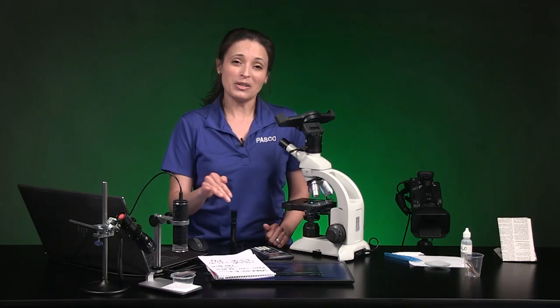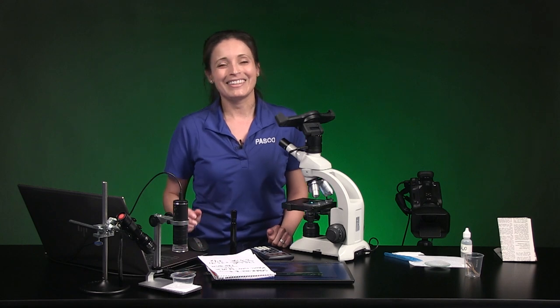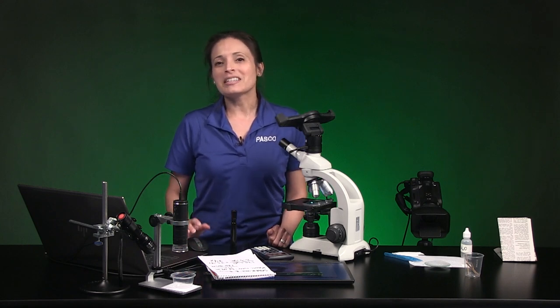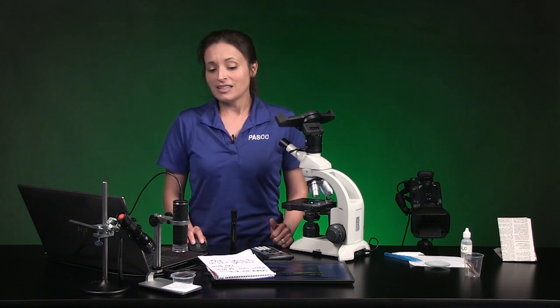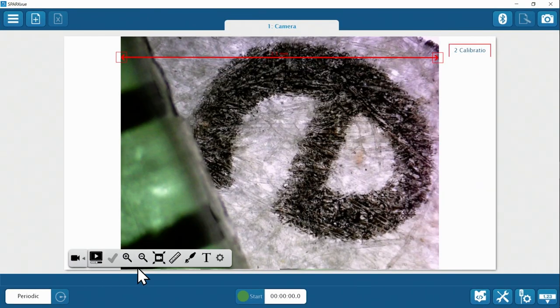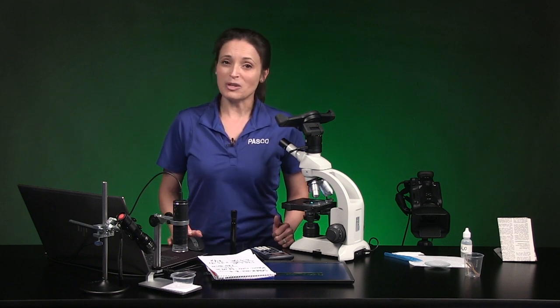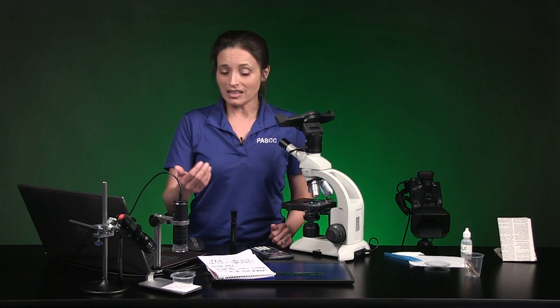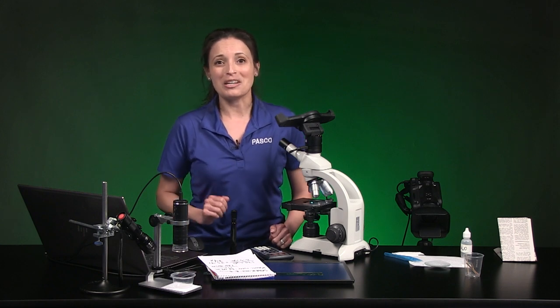You need to get the answer on your own in SparkView with the window at full screen on your device. Your answer should be different from mine — it shouldn't be 74x. Go into the Camera Tools menu after you're done getting your magnification and explore some different tools in SparkView that we haven't looked at yet. Pause the video, grab a ruler, report your screen-based ruler measurement in row 3 of Table 2, calculate your screen magnification power, and answer questions 3, 4, and 5. Continue playing when you're ready for part 5.